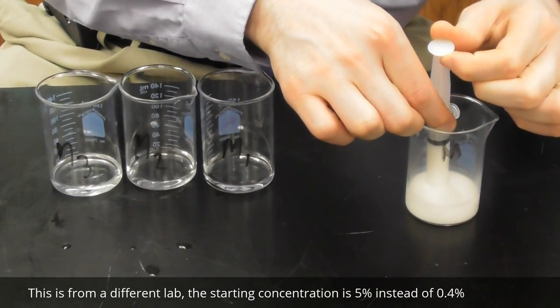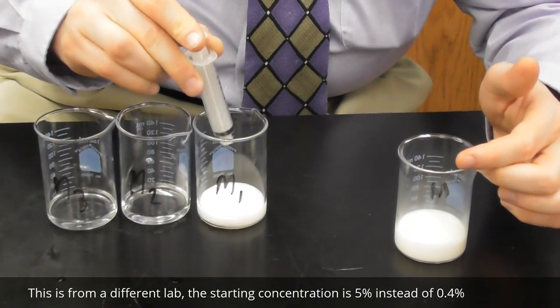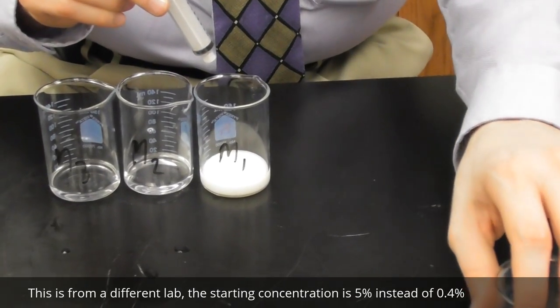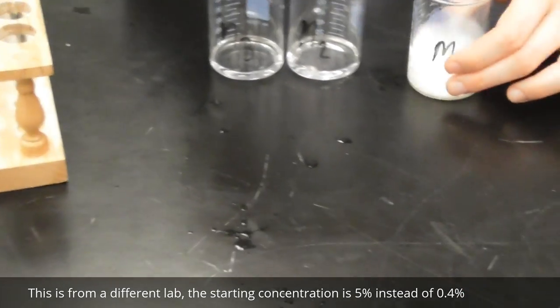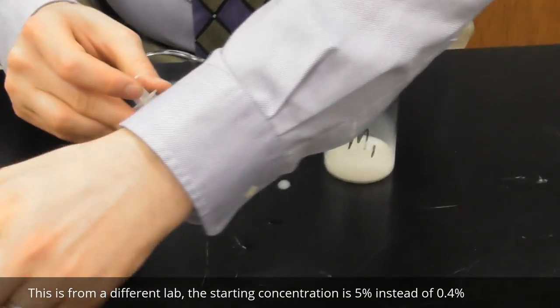And why not just take from my bench reagent and put it directly into there? And now I'm done with my bench reagent. I put that off to the side. Now I swirl my M1. My M1 is ready.